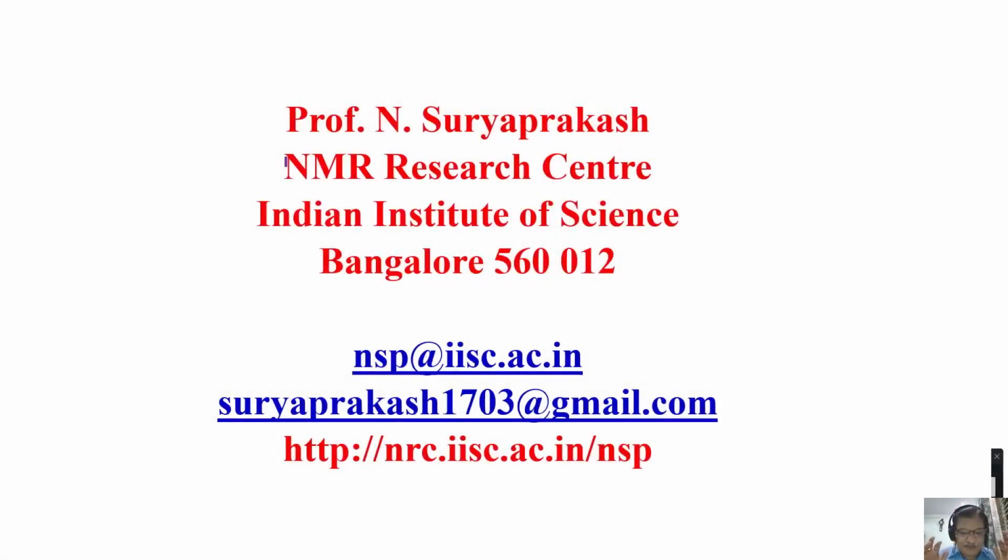Welcome back. In the last class, we started discussing the processing of NMR time domain data. We discussed at length about Fourier transformation, what happened to this time domain signal, resolving it into Mx and My components, and then finally we introduced the decaying function, and we also brought in the phase component, where there will be phase errors when the real and imaginary components are not exactly out of phase by 90 degrees. Varieties of things we discussed. We discussed a lot of Fourier transformation functions also.